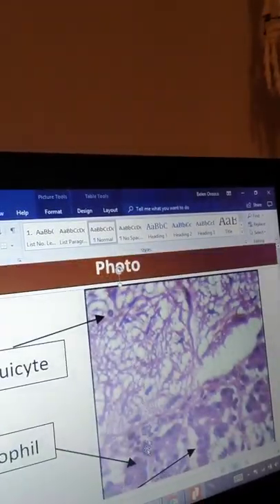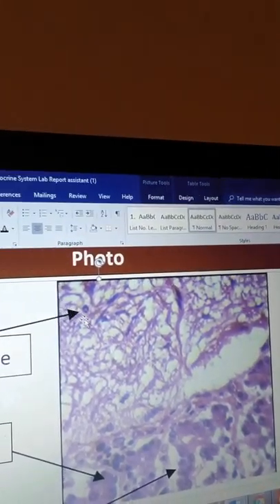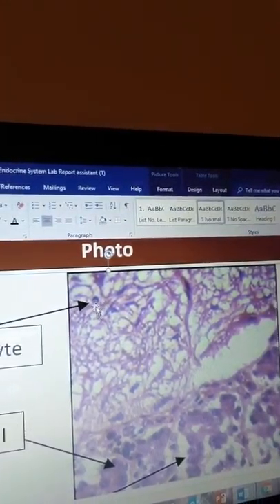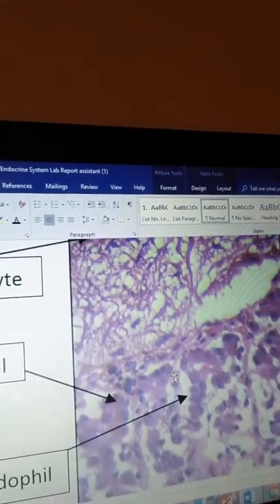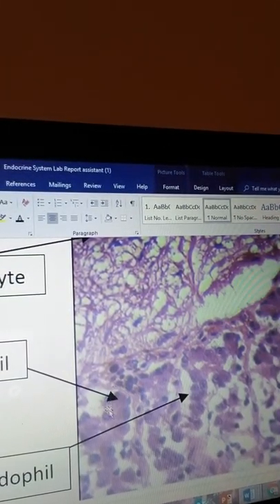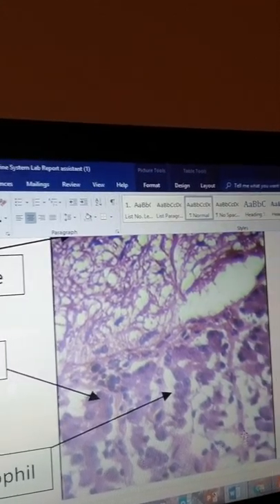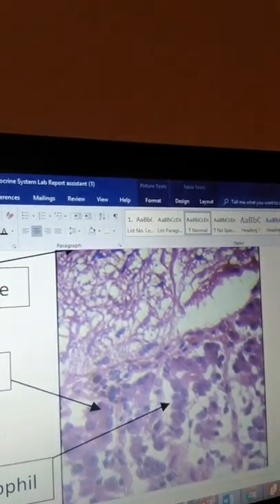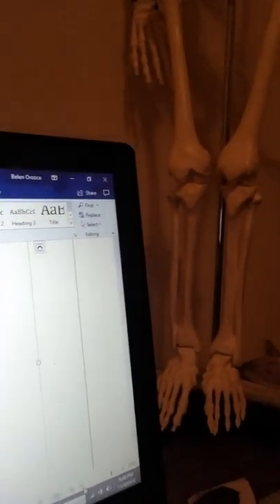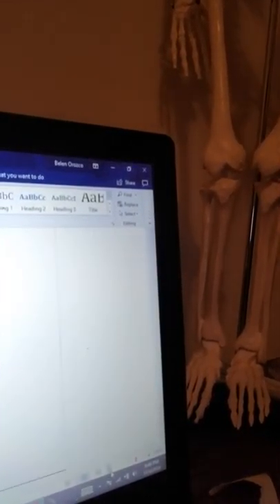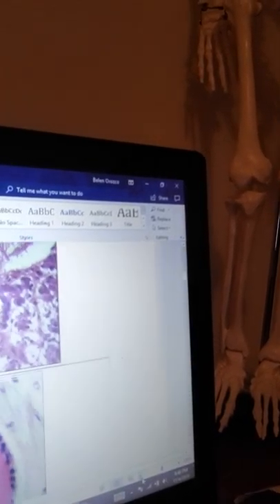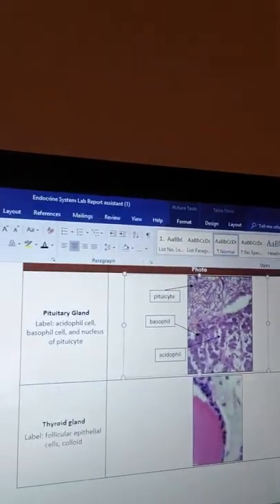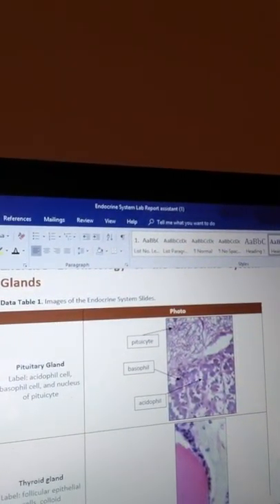So now that all the cells are properly labeled: my pituicyte cell right over here, my basophil which is that reddish hint to it, and my acidophil right here. Now that it's all labeled nicely I'll go ahead and put the screen back to normal at 100% zoom.